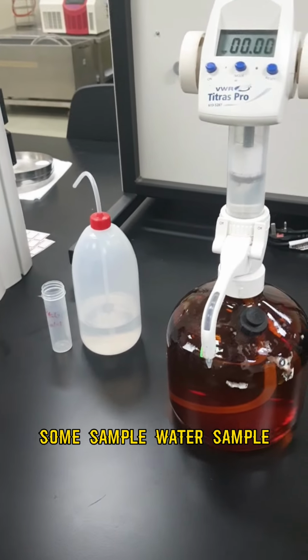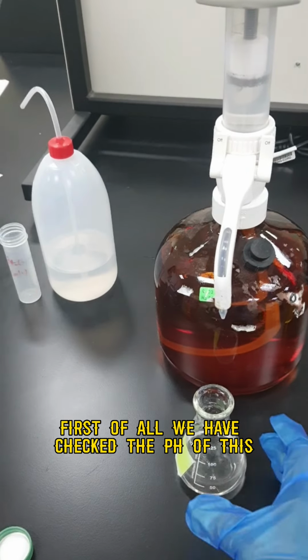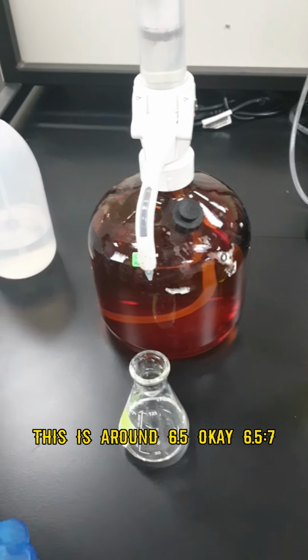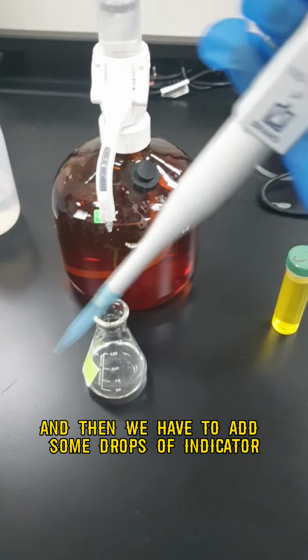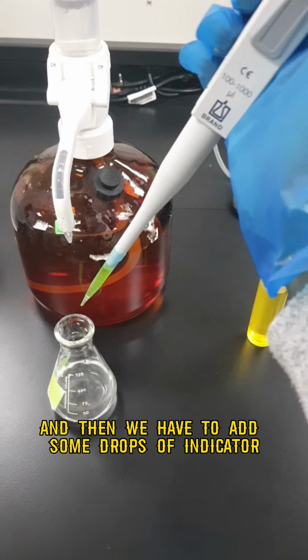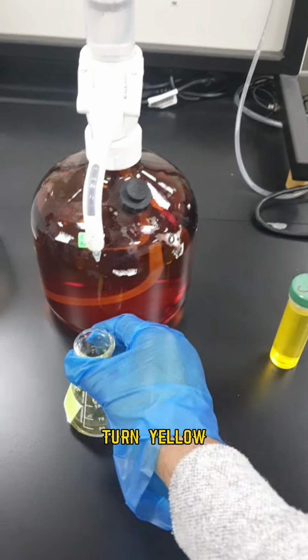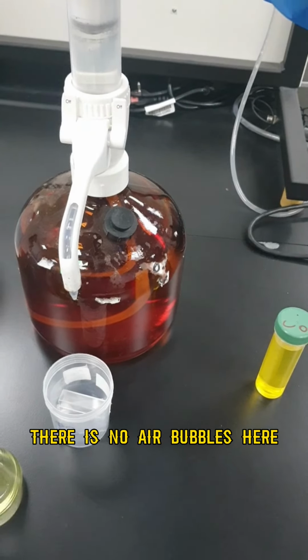And we need some water sample. Before finding out the chloride in the water, first of all we have checked the pH, which is around 6.5 to 7. This is our tap water sample, and then we have to add some drops of indicator. When you add the indicator, it will turn yellow. We have to make sure that there are no air bubbles here.